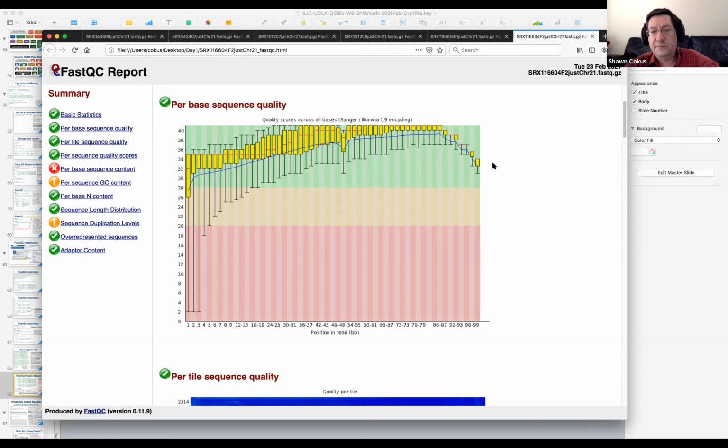On the Illumina platform, Q30 plus is common and very good. Q20 is not that bad, it's only a 1% chance of error. Below Q20, not so good. The modern platform doesn't even distinguish many quality score values. Essentially there are things near 0 and things near 30, and there are only 3 or 4 scores they use anymore. But these older ones are more continuous for the quality score estimation.